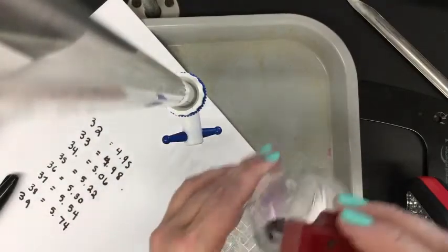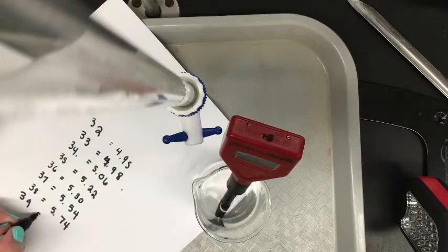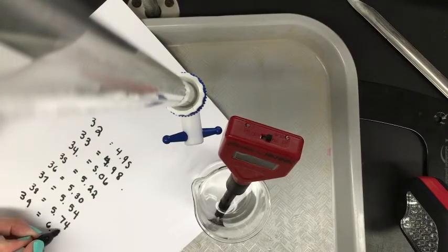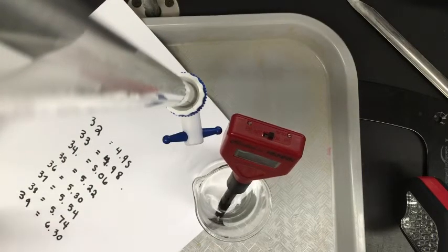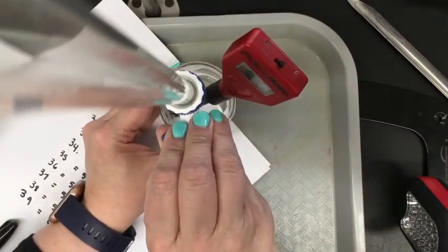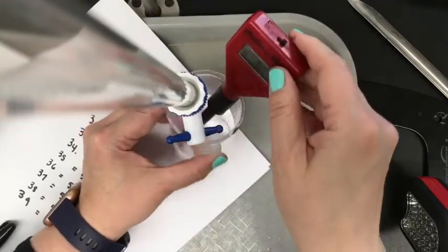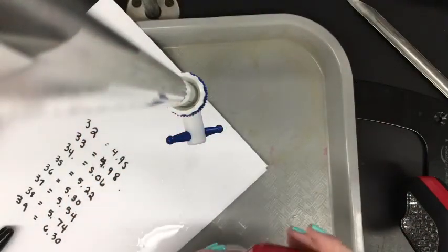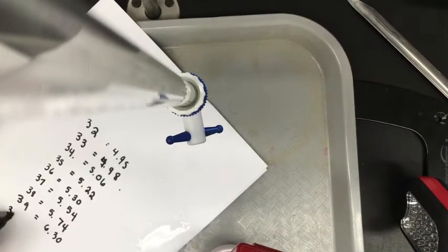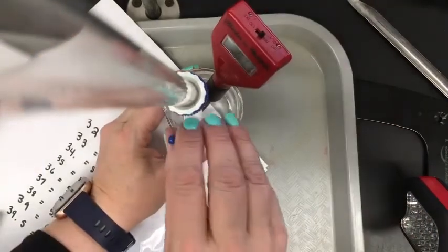You can see that there's some pink happening each time. That time we jumped to 6.30. Okay, now I'm really going to just add a little bit at a time, so half a milliliter. So this time I did 39.5. We went up all the way to 9.40. Yeah, so we hit our equivalence point.